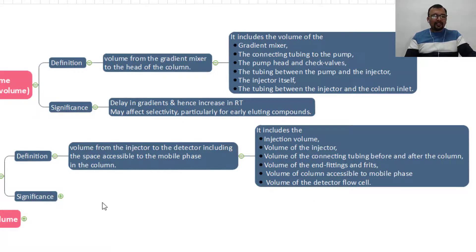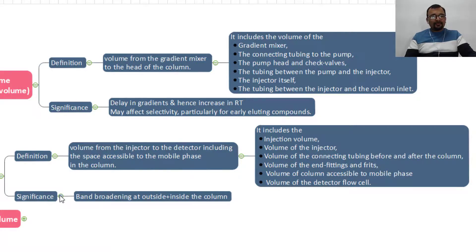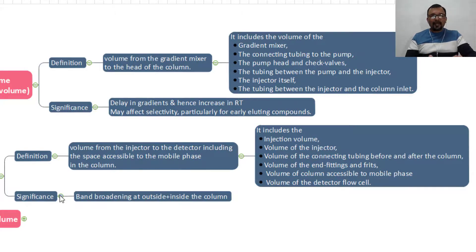The significance of void volume is that it causes band broadening both outside and inside the column. You cannot avoid void volume because you have to connect the injector with the column and then the column to the detector — you cannot have a system with zero void volume. The void volume causes band broadening of the compound; the greater the void volume, the bigger the band broadening, resulting in poor resolution, poor response, and poor peak shape. It is very important to keep your void volume as low as possible.